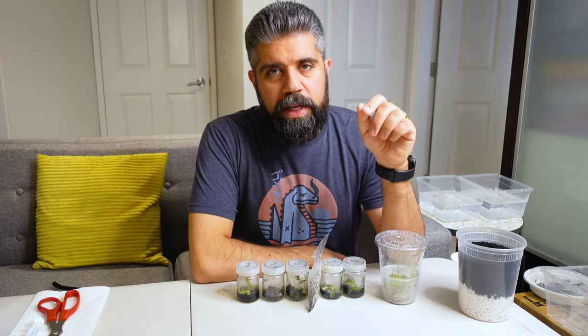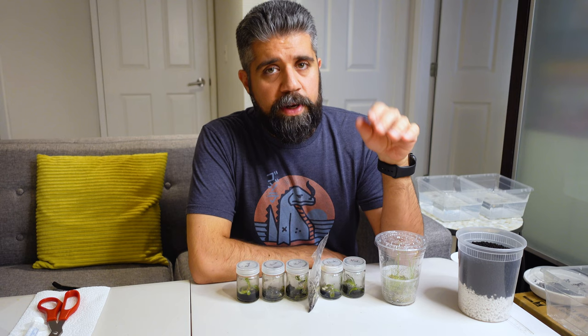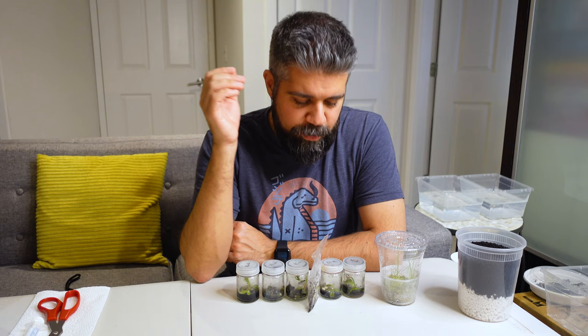If you've ever wondered what it would be like to deflask tissue culture plants in your house with zero knowledge of what you're doing, this is the place for you to be. I'm kidding — I do have some research behind me now, but it's pretty minimal. This is the first time I'm trying this. Here goes nothing.